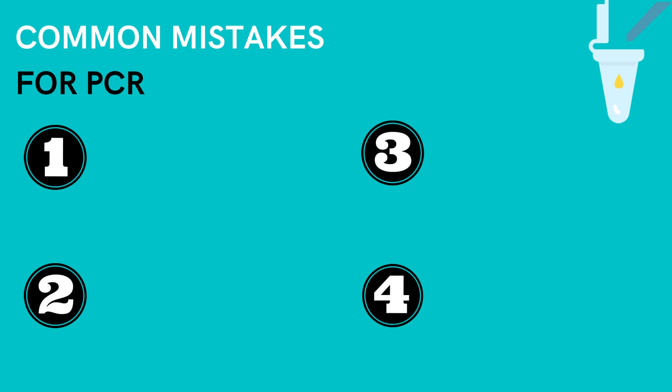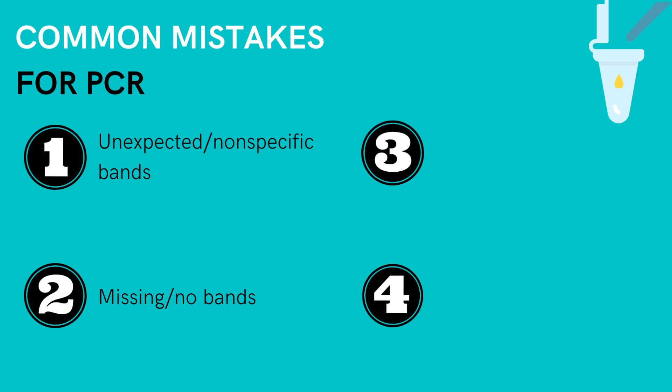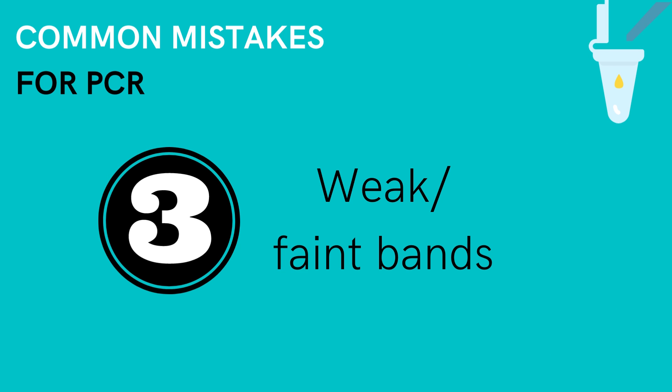However, during this process, there are common mistakes students make. Some of these include, but are not limited to, unexpected or nonspecific bands, weak or faint bands, missing or no bands, and smeared bands. Of these four common mistakes, weak or faint bands seem to be the most common.